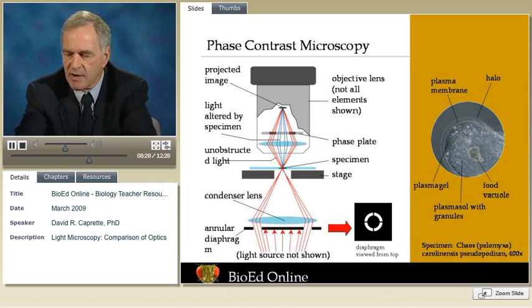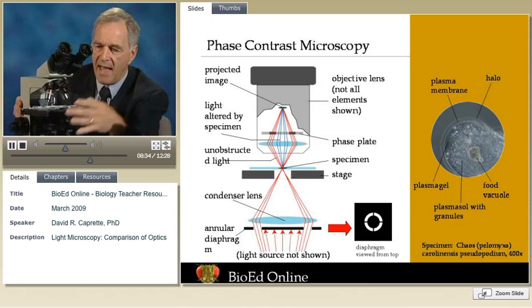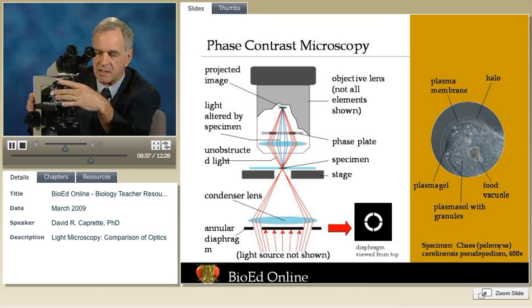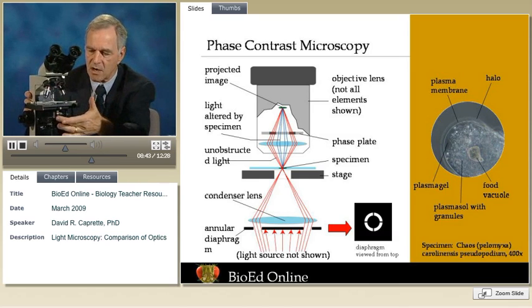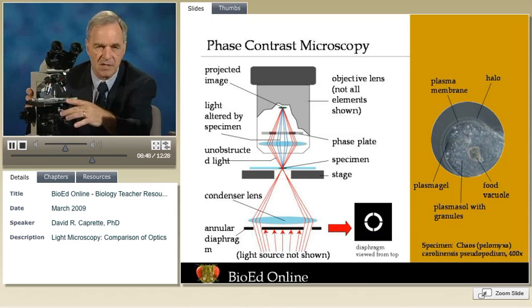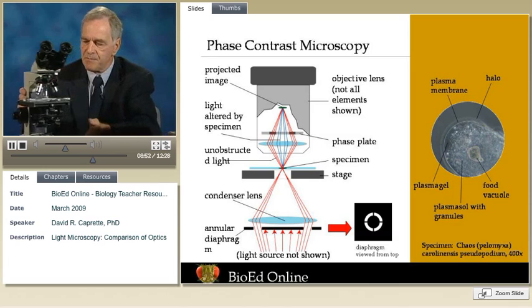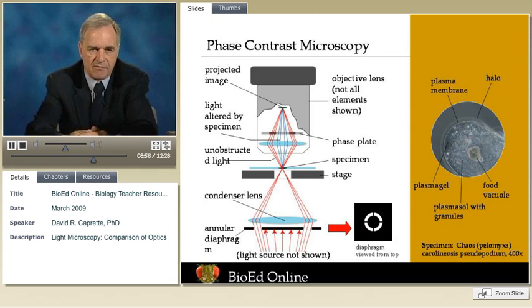Now, phase contrast optics are kind of expensive. They require modifications to both the condenser and specialized objective lenses. There are elements in the lenses that affect the passage of light, and there are annular rings that have to go into the condenser. You have to have a different type of annular ring for each magnification of objective lens, and thus the packages cost, as I mentioned, upwards of a few $100s to $1,000 or so.